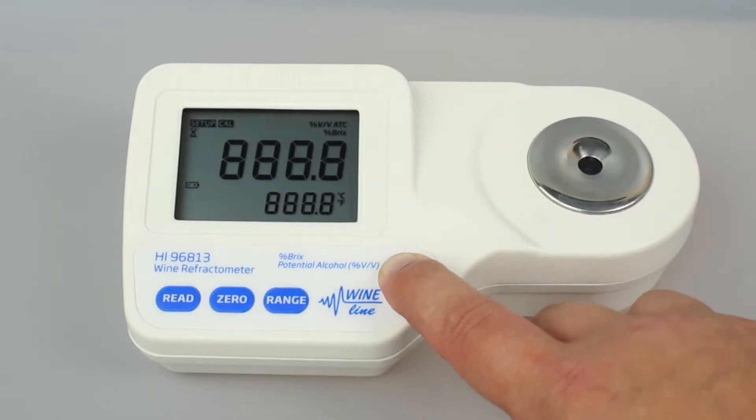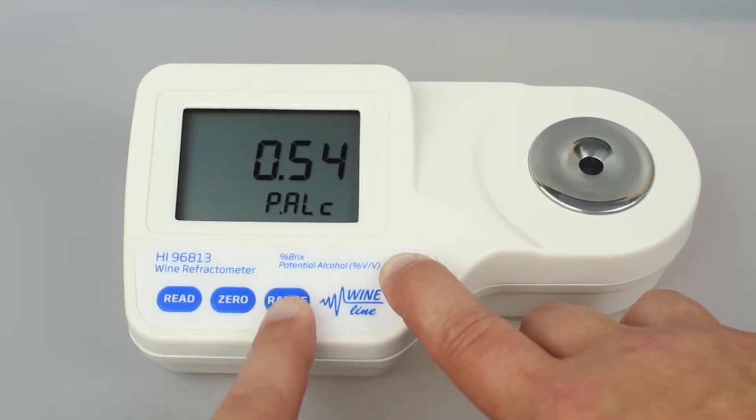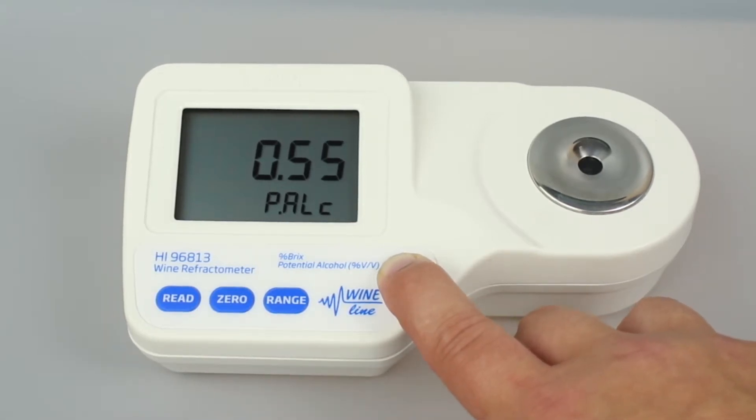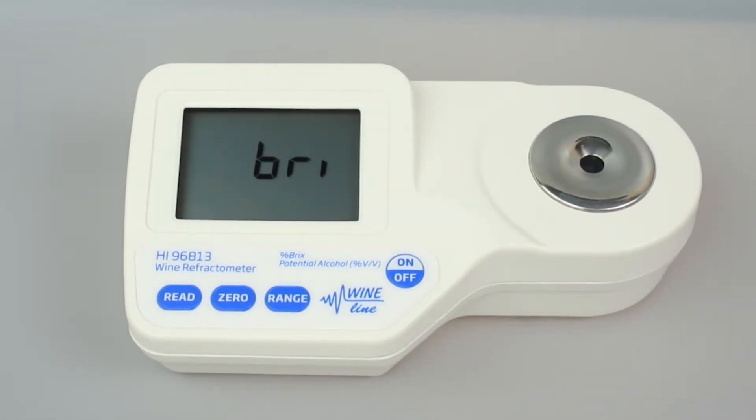To change the potential alcohol conversion factor, press and hold ON-OFF for 15 seconds until the screen flashes. Then while holding the ON-OFF button, press range, then 0 until the desired conversion factor is shown on the screen. 0.55 is a common conversion factor. Once you are done, release the ON-OFF button.